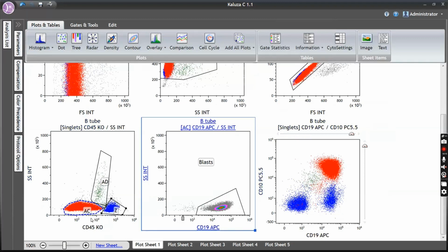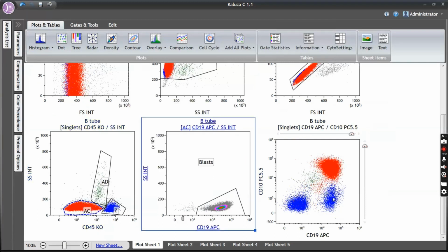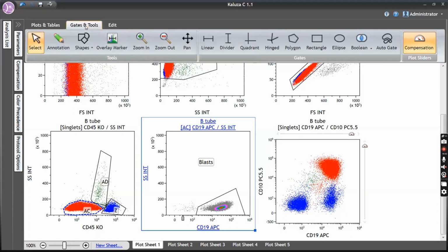Right? Now someone will tell me the intensity. What is the expression of CD19 in this blast? CD19 moderate and CD10 bright. Yeah, so CD19 is moderate. So no more positives and negatives. We are in advanced flow cytometry. Now when it is positive, we need to call it by intensity. If markers like TDT, MPO, you can call positive, negative, but other markers we need to call by intensity.